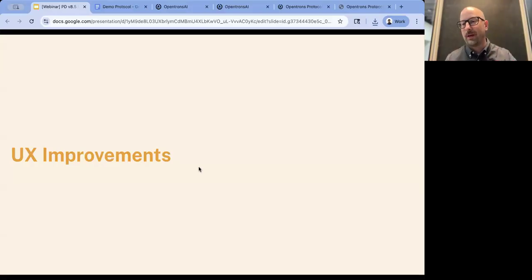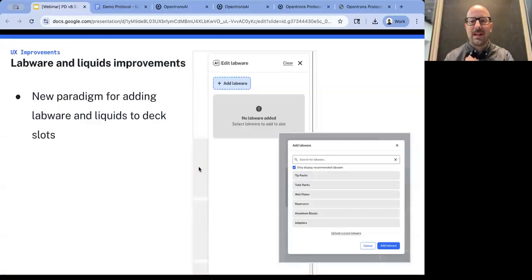So that's why we want your feedback. That's why we have these feedback forms. That's why we ask for it on these webinars. I want to go through a couple of things that we changed that I think are in a lot better shape now. So setting up your labware and liquids, I think, is much better in 8.5.